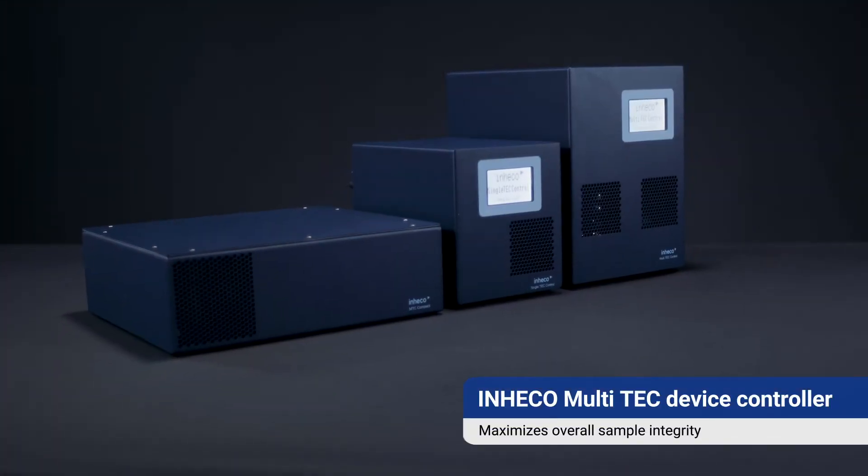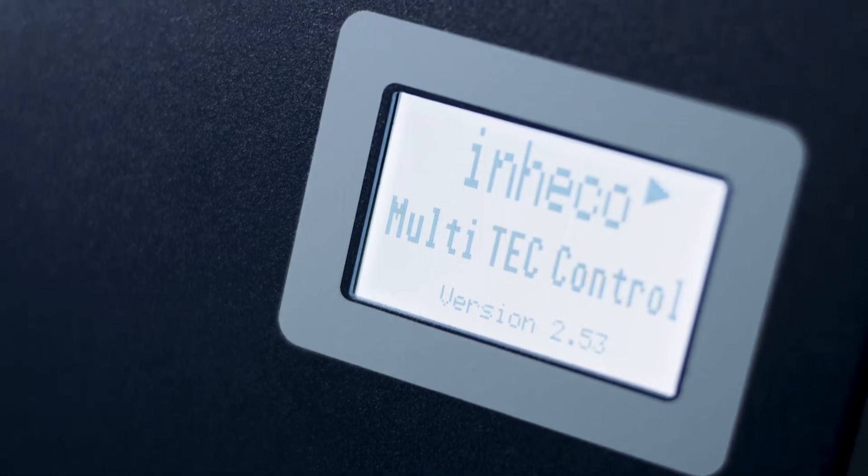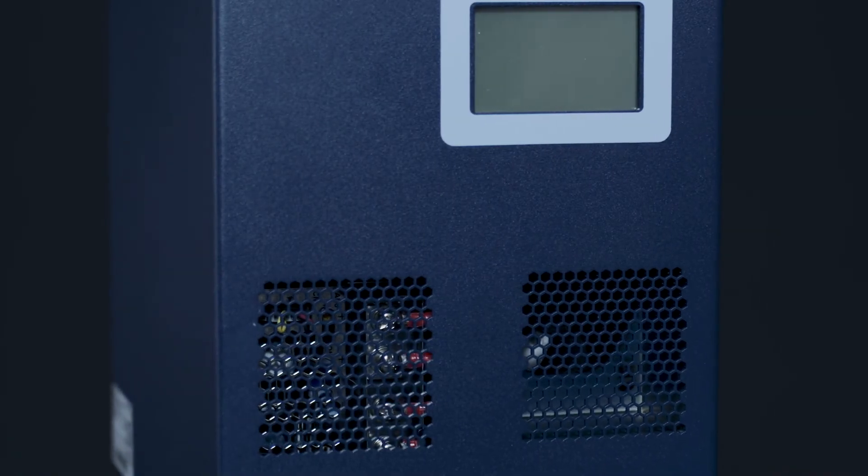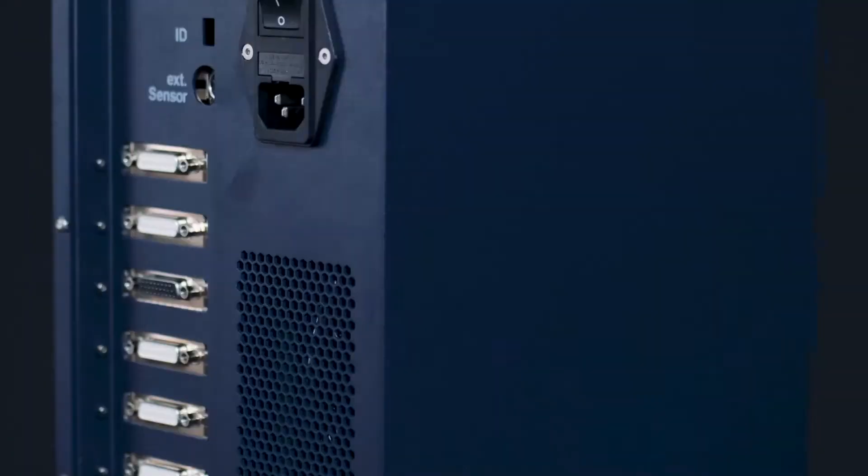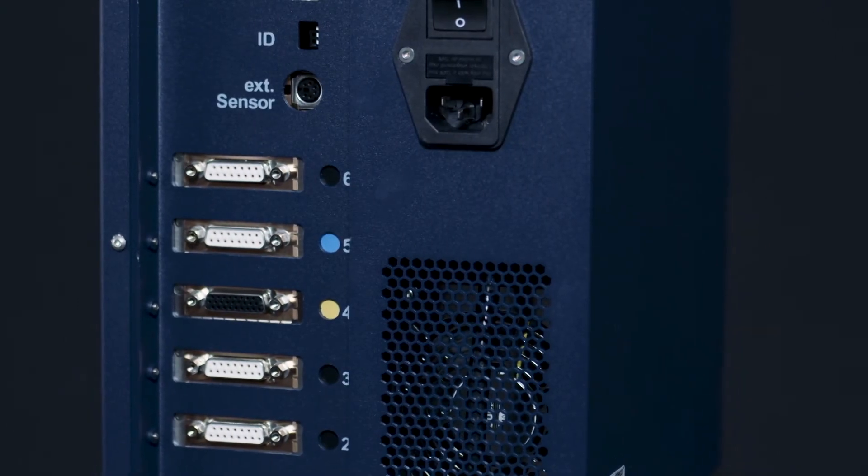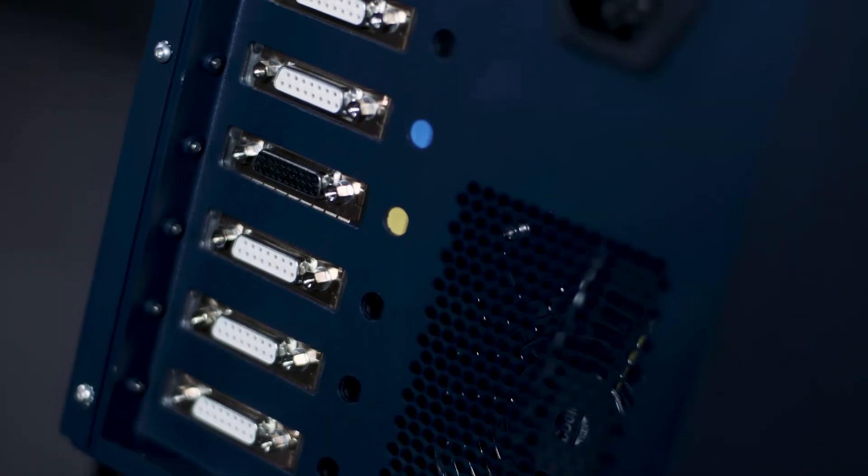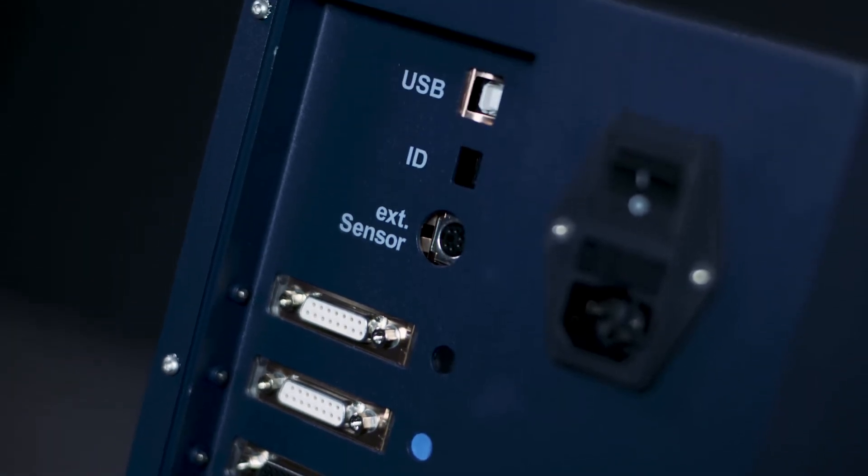The separate off-deck control units further minimize on-deck space, noise and temperature generation. When multiple Inheko products are in use on a deck, Inheko's multi-tech control unit can control up to six devices in parallel.